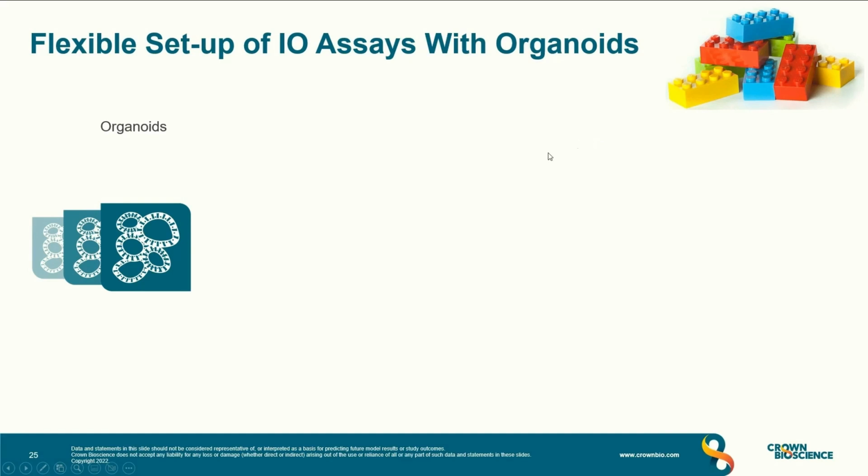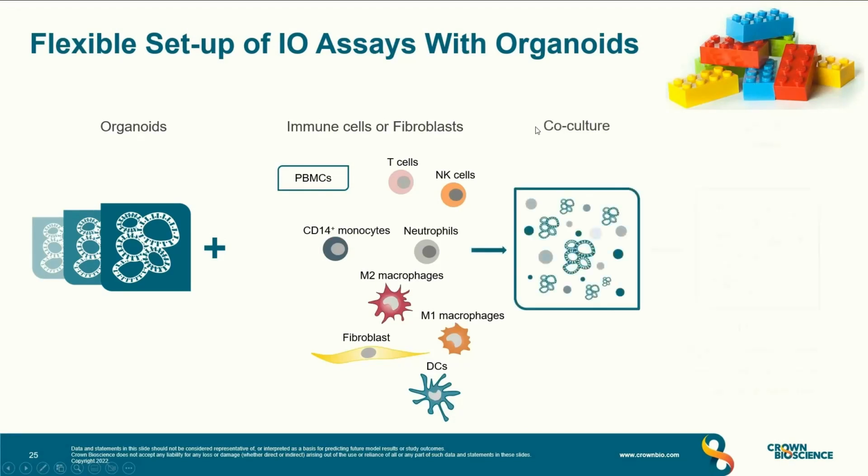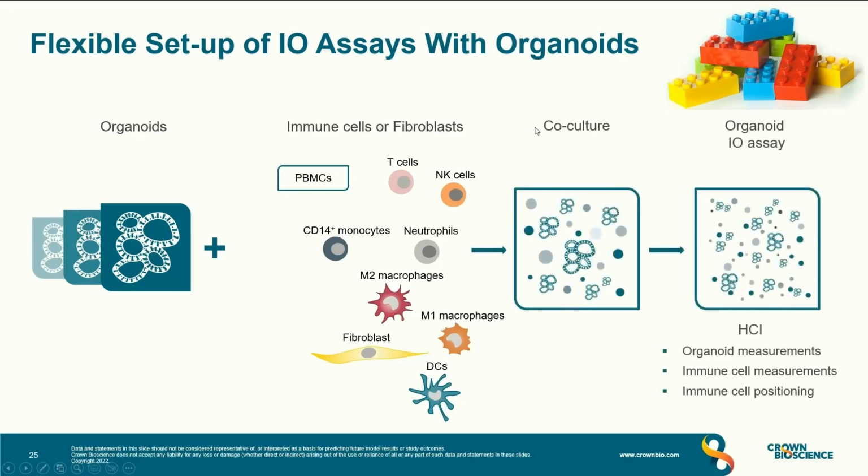I provided an example where we use organoids in combination with quite a variety of myeloid cells and lymphoid cells, like small Lego blocks to reconstitute the tumor of interest, and then use these co-cultures to make all kinds of measurements on killing, infiltration, polarization, and hopefully this will help with discovering some very interesting therapies in the near future.